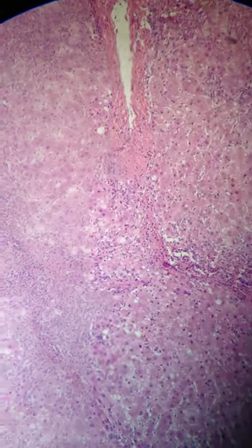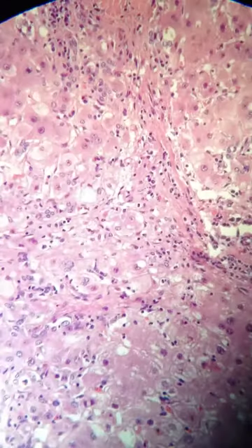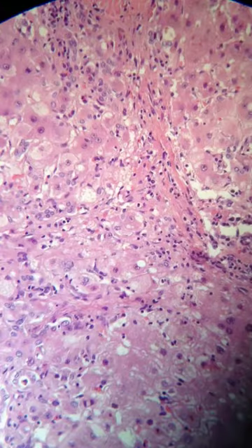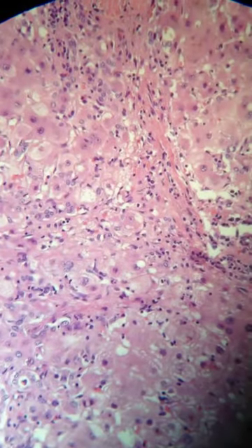Let's try it at 20x. The quality is great, right? Excellent — but of course that's only as good as the optics in your scope. If you have a great scope you're going to have great results. I have great optics. And we didn't have to focus at all.